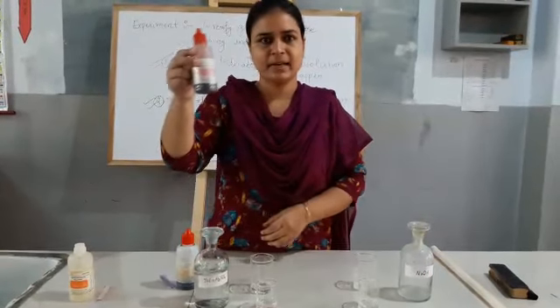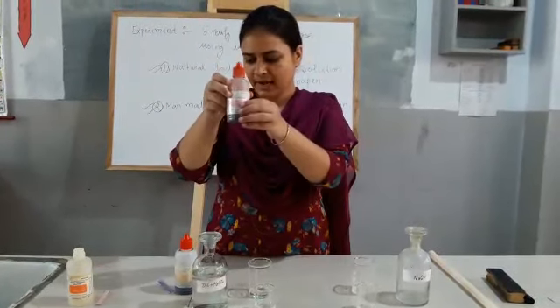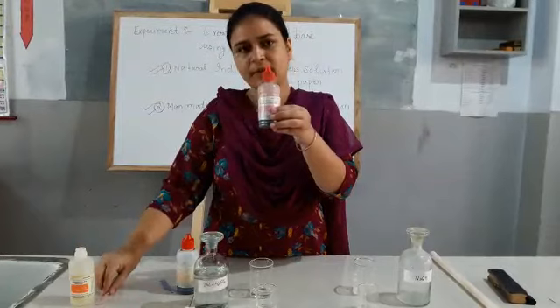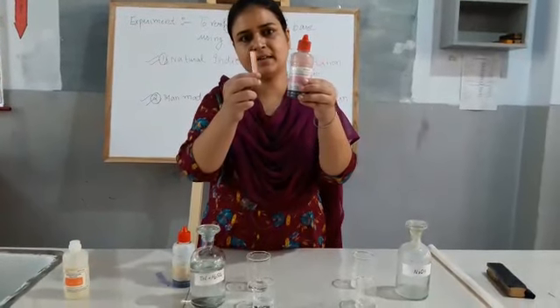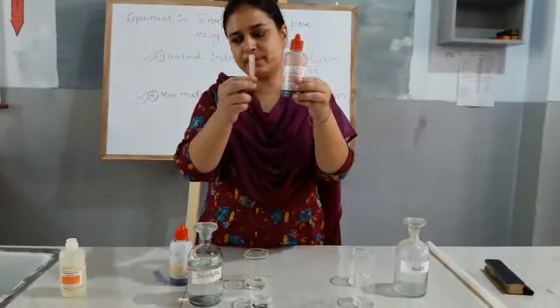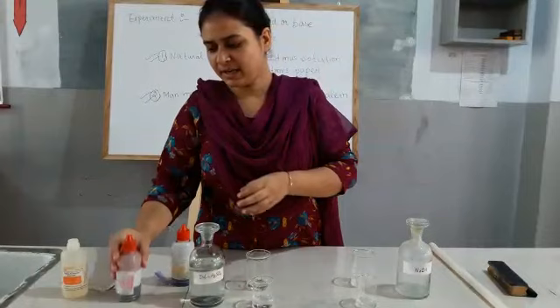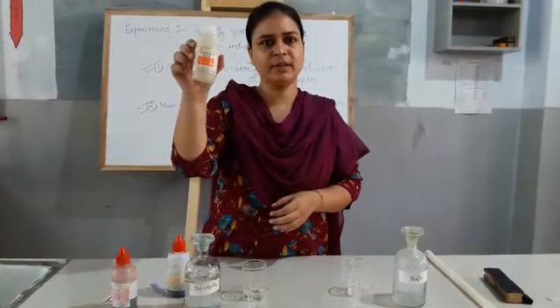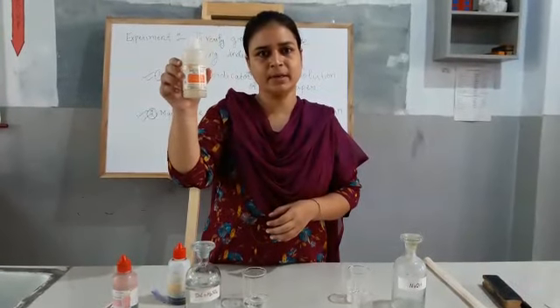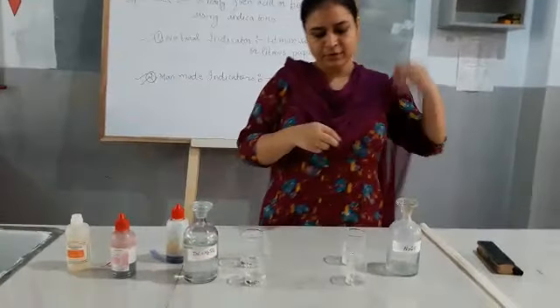The second indicator is litmus solution red, which is also available in the form of solution as well as strips. And in the man-made indicator, I am using phenolphthalein. So let us do our activity.